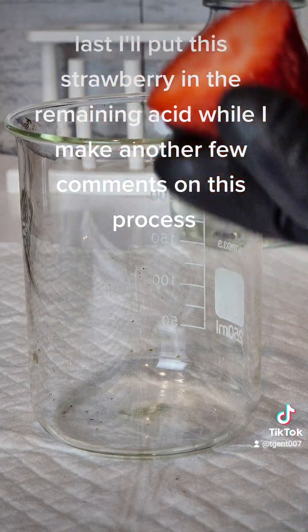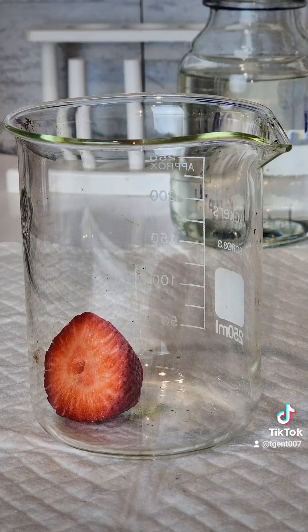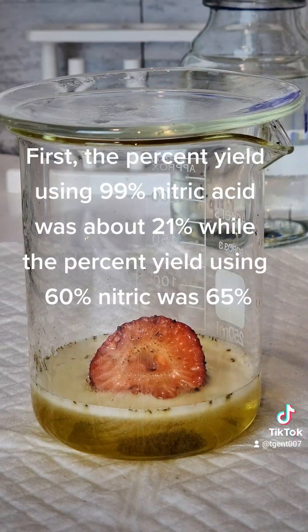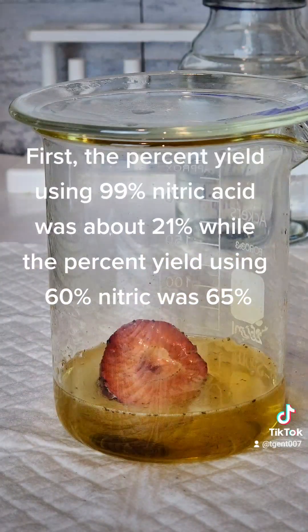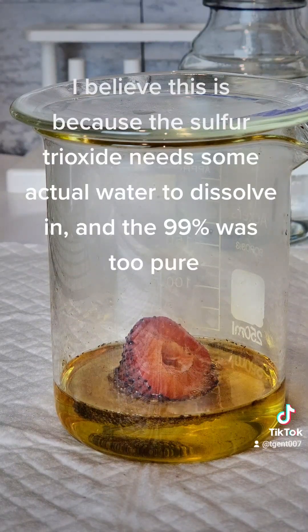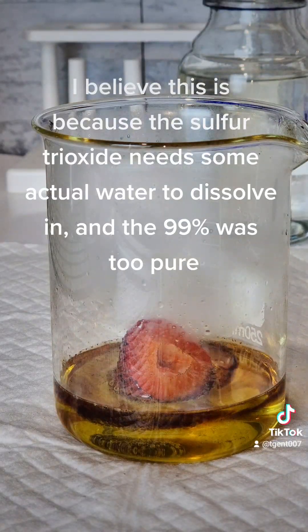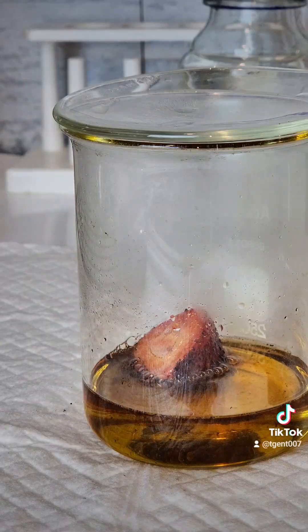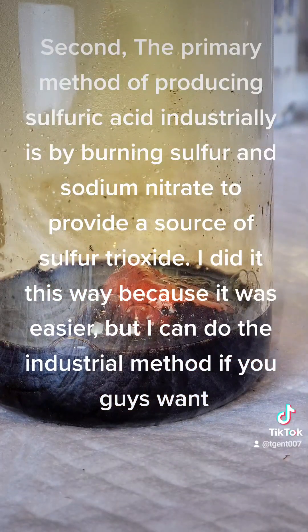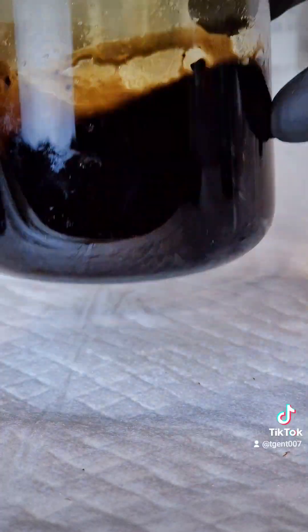I'll put this strawberry in the remaining acid while I make a few comments on this process. The percent yield using 99% nitric acid was about 21%, while the percent yield using 60% nitric acid was 65%. I believe this is because the sulfur trioxide needs some actual water to dissolve in, and the 99% was too pure. The primary method of producing sulfuric acid industrially is by burning sulfur and sodium nitrate to provide a source of sulfur trioxide.